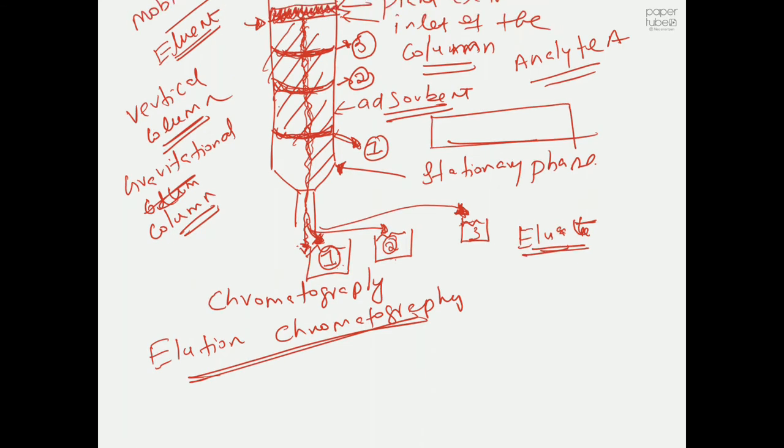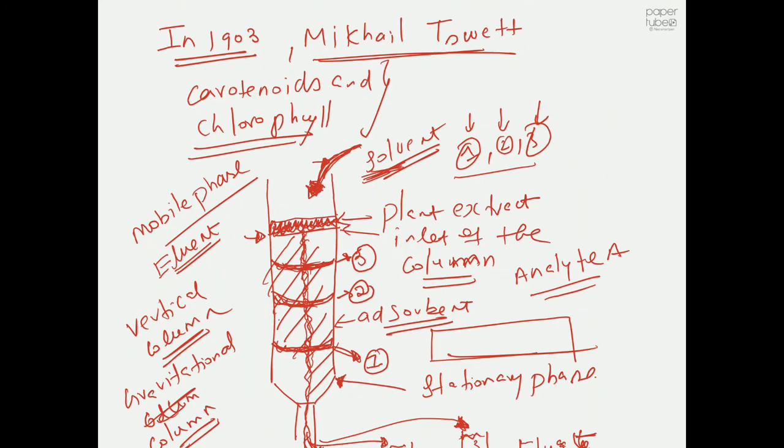So these are some terminologies that you should remember when we talk about chromatography. You should know what is eluent, what is eluate, what is meant by analytes, and what is a mobile phase. We call it a mobile phase because this is the one doing the job. It's the one transporting your analytes from the top of the column to the column exit through the stationary phase, where everything is happening. Everything in the sense separation is happening. So try to remember these terminologies.